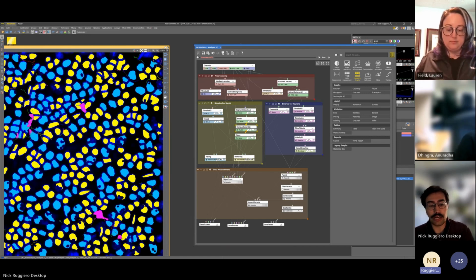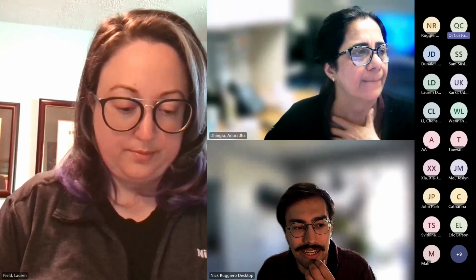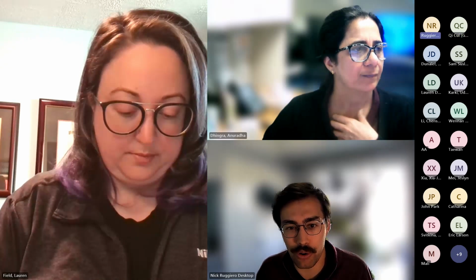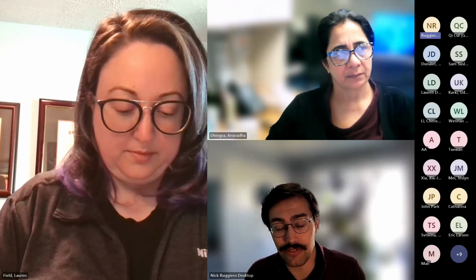It will be dependent, again, if you have some stuff like, I know some of these images, there are some chunks that are a little bit out of focus. Yeah, that's true. Because we don't use focal for these. Exactly. I think it's going to struggle a little bit on those. I just don't think it will be able to segment out some of those nuclei so well, but for the rest of the image, it should do a pretty good job.